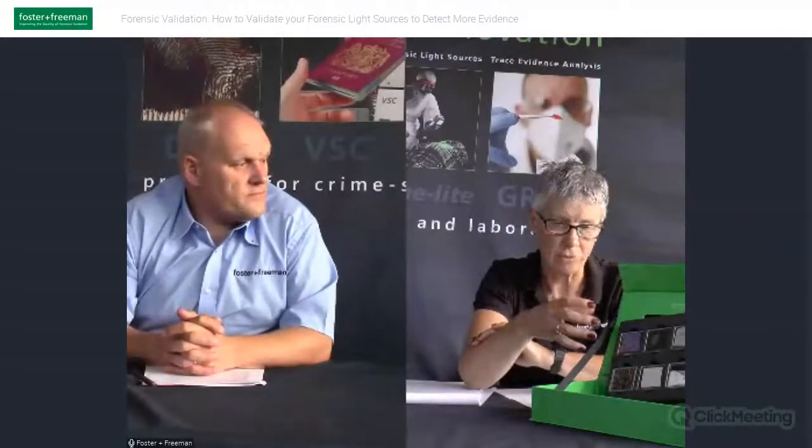What about the disposable gloves, Yvonne? That's a good point. There's no danger of contaminating the body fluid with your DNA, because you're not looking for the DNA when using the sample kit.